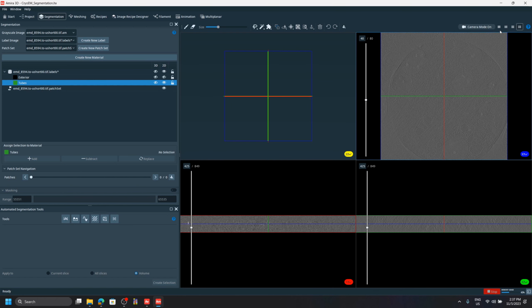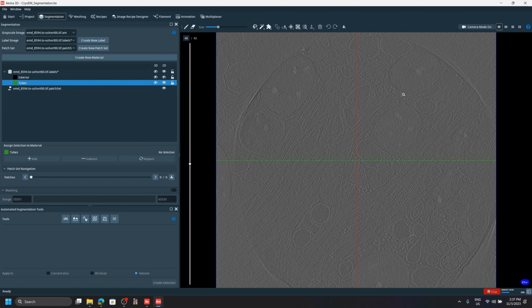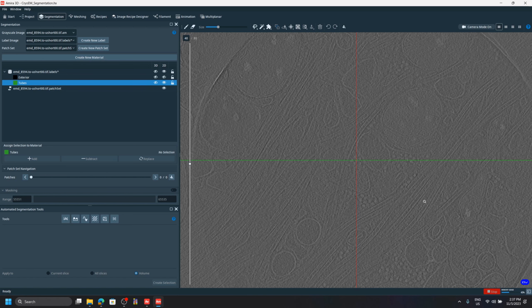Right, so let's zoom in over here. Okay, so let me just brush. Let me zoom in some more.